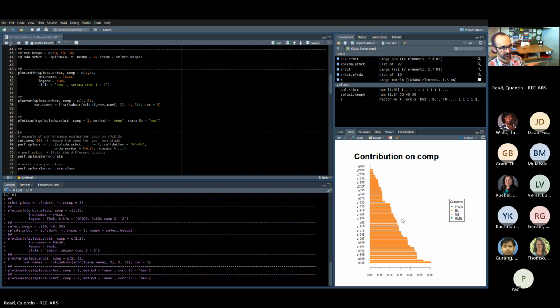And that's a very strong signal, right? It's the axis explaining most of the variation. So the strongest signal in the data is that this BL, whatever lymphoma tumor we're dealing with here, is highly elevated in expression of a bunch of genes that are not very highly expressed in any other type of cancer tumor that we have. That's what this is showing us.